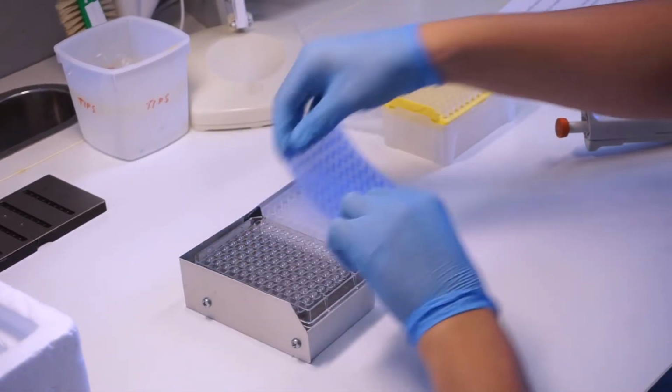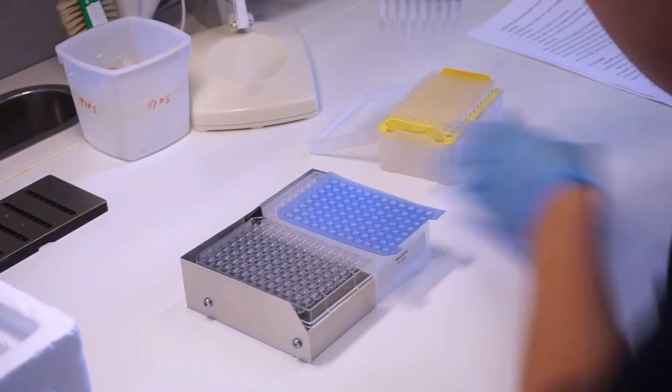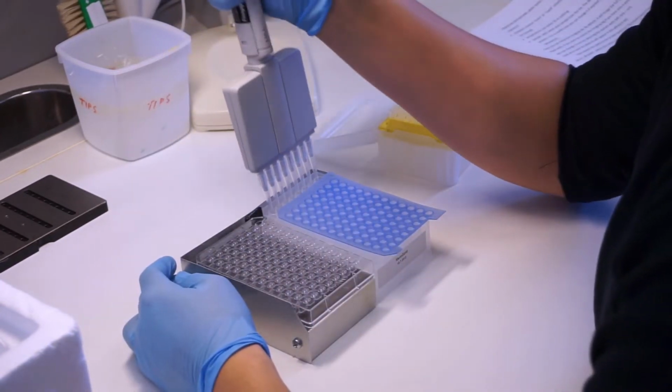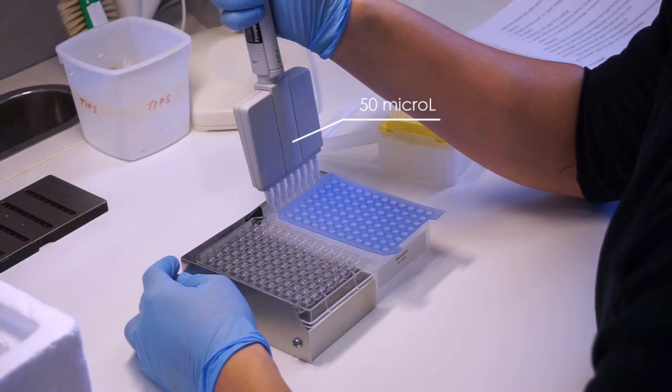Pipette screen into wells on the MRC plate using a multi-channel pipette. Put 50 microliters of solution.